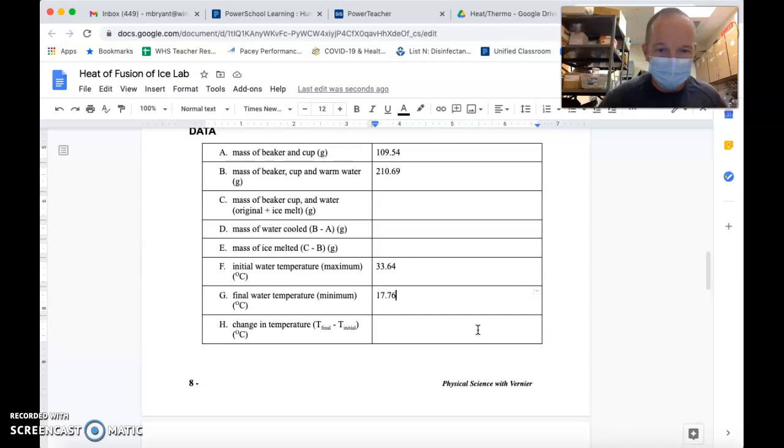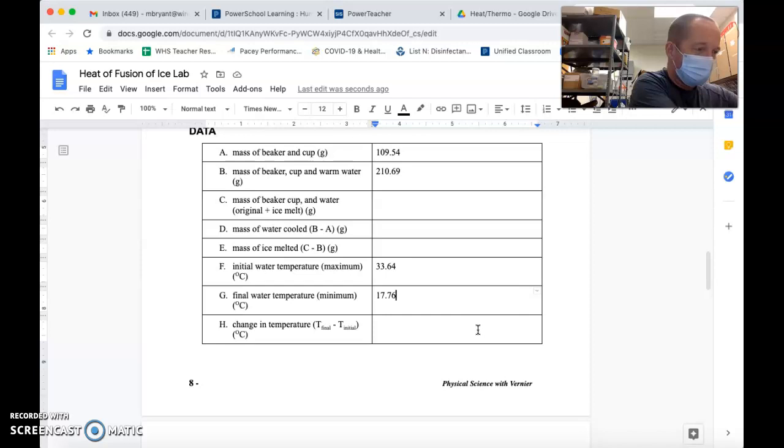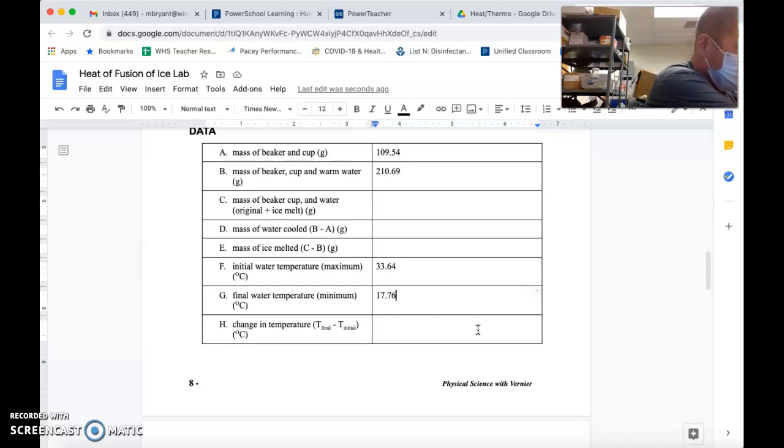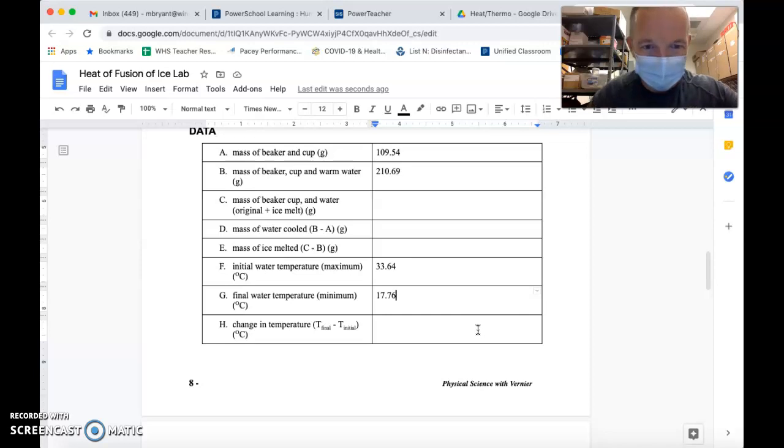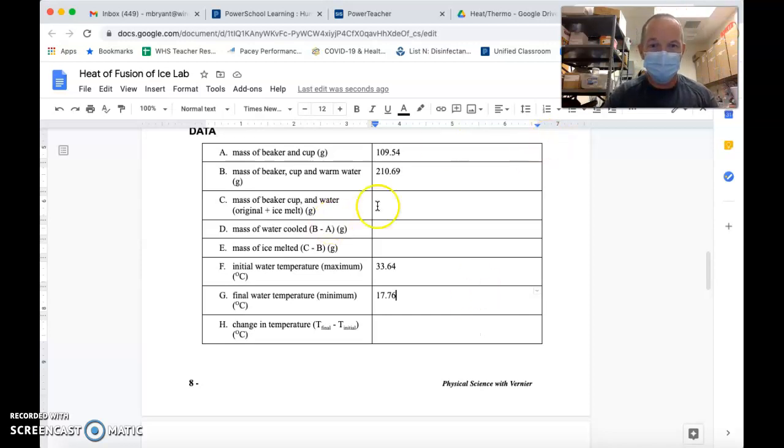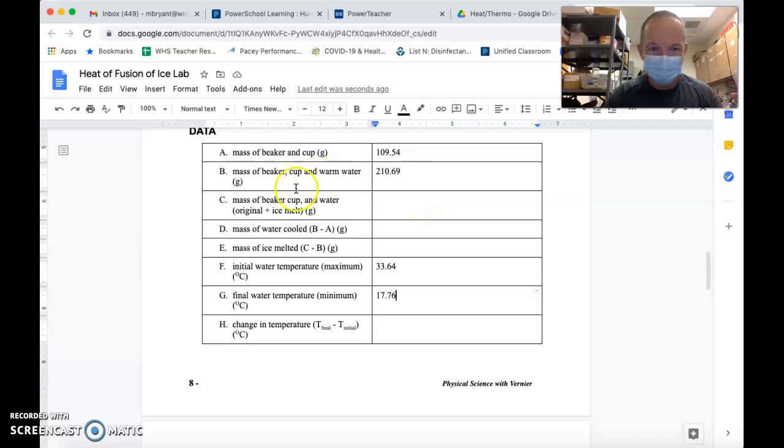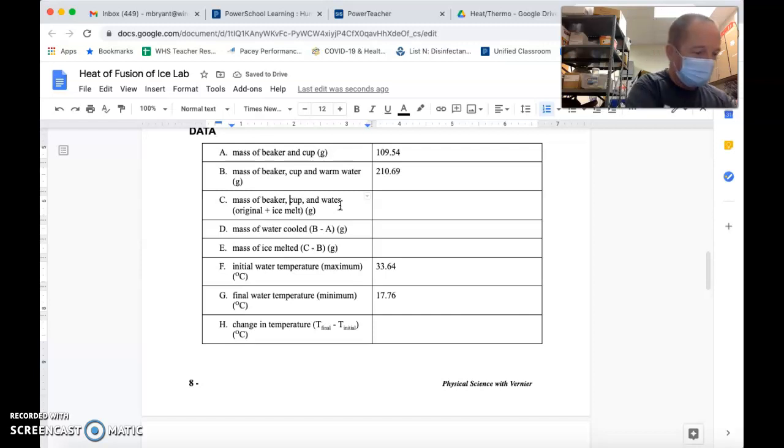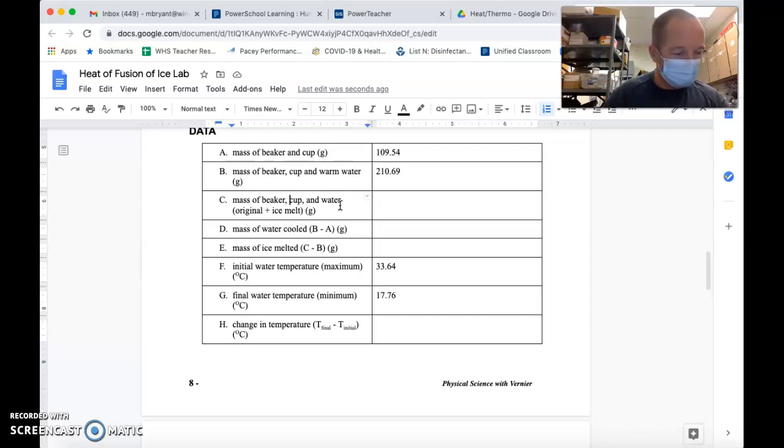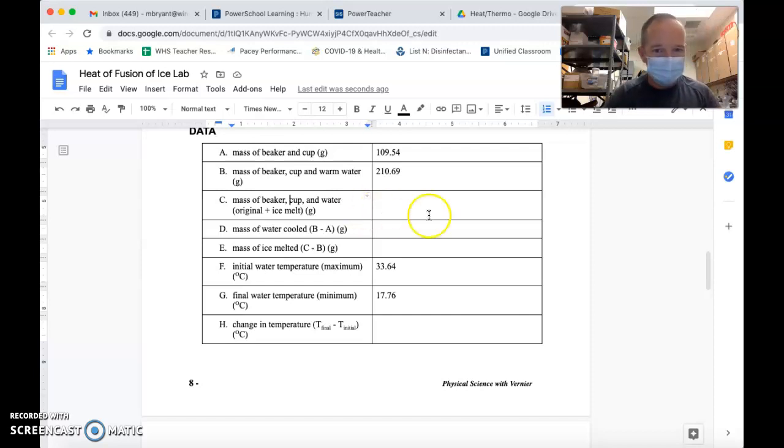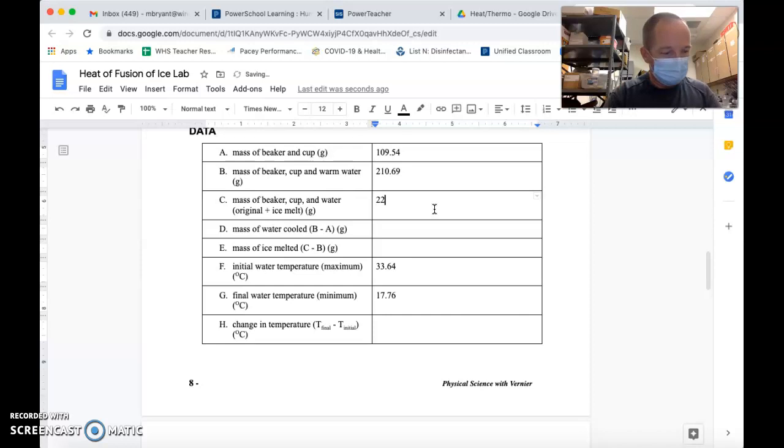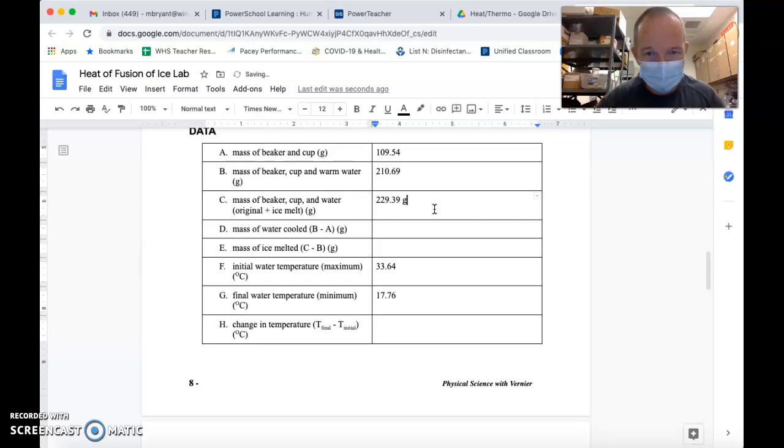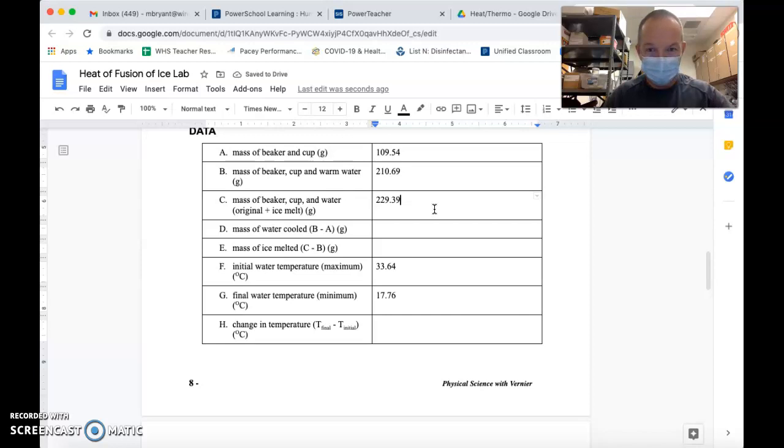Now, the last thing I have to do to give you the data that you need to work with is to measure the mass of everything that we finished with. In row C here, we're going to have the mass of the beaker, the cup, and the water. I realized I forgot a comma here. I'm going to record that mass, and we're going to be able to use that to get all of the other masses. I get that mass to be 229.39 grams. That means we used not quite 20 grams of ice to cool down that water, and we did it pretty quickly.